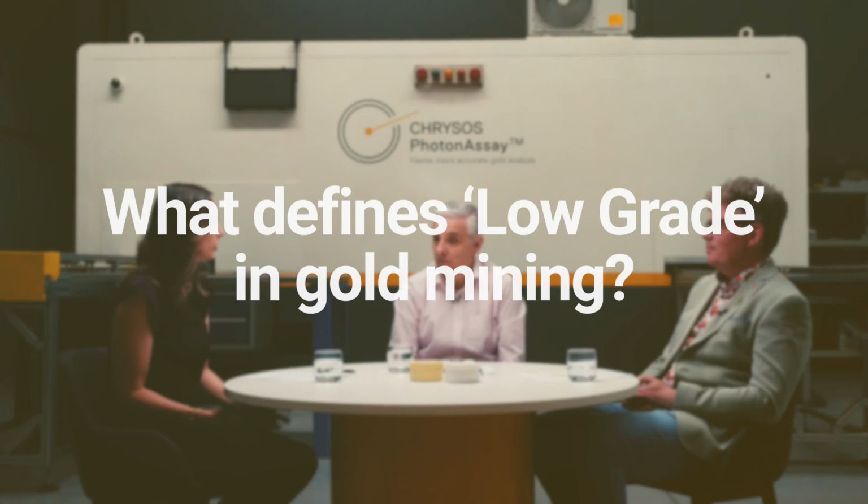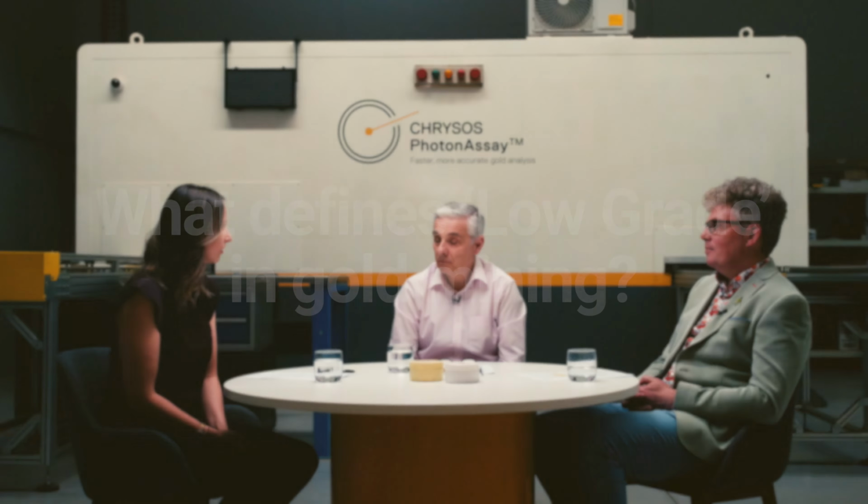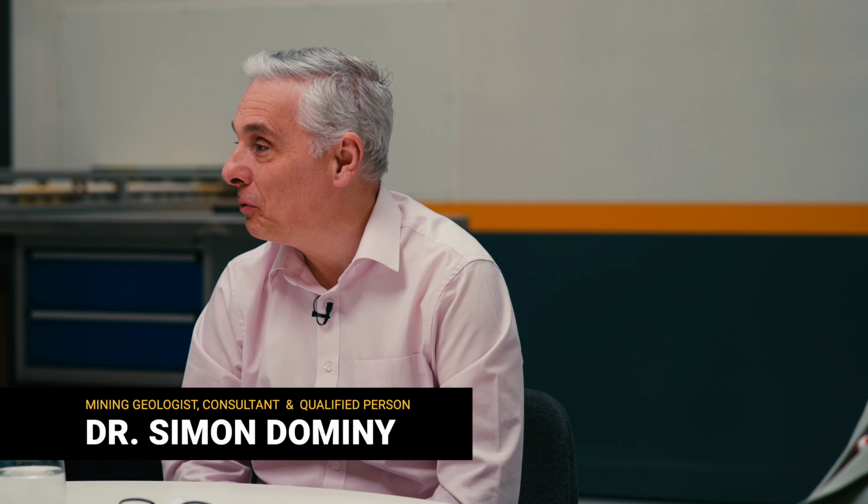So a question we often get asked about is instrument precision at low grades. From your perspective, what do you classify as low grade and why are low grade samples important? In general terms, a lower grade is probably 0.5 gram a tonne or below.